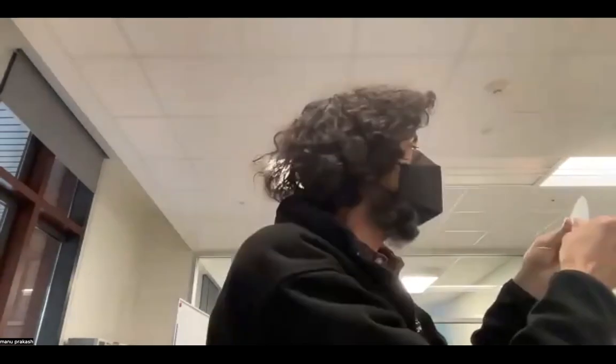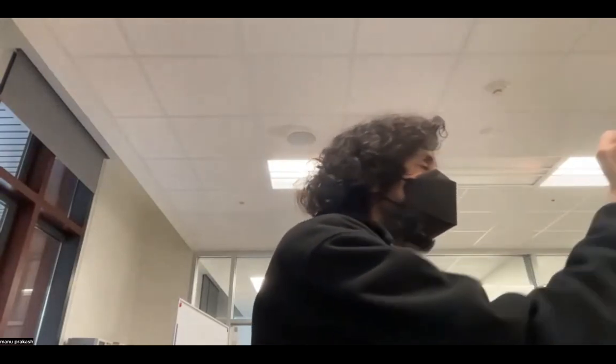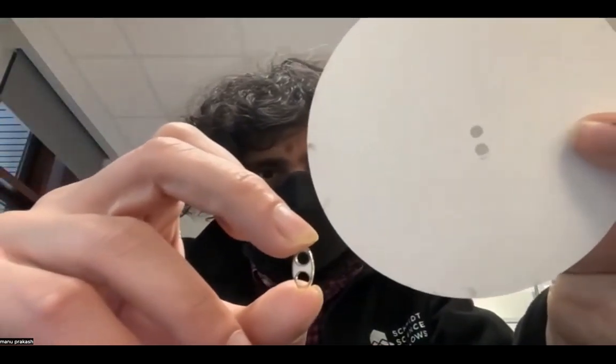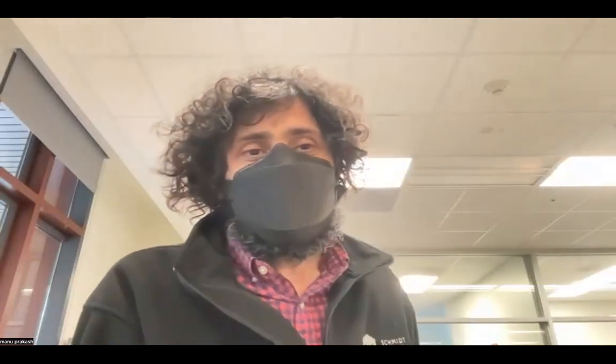It has a polymer coating on it. And then we put a little piece in the center that's an acrylic piece. So when the strings pull on it, it actually doesn't tear the piece of paper. So what I'm going to do is just do a construction for one to show you guys. For folks that are online, you should find any material, any piece of plastic, a cap.